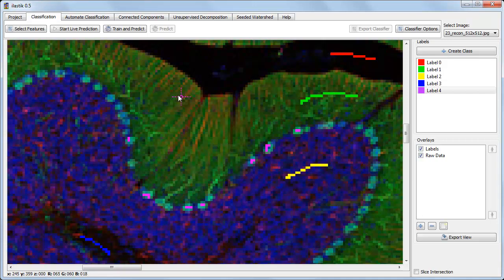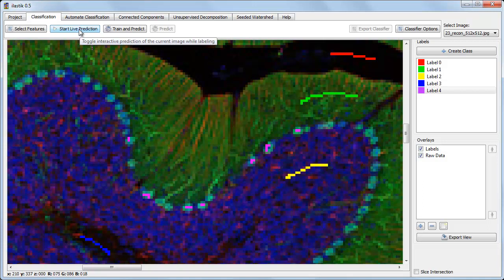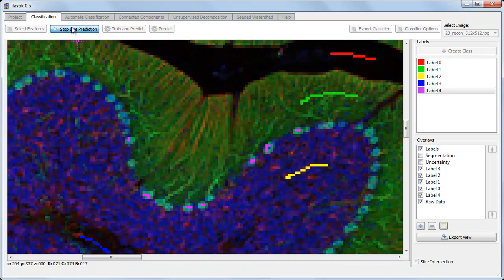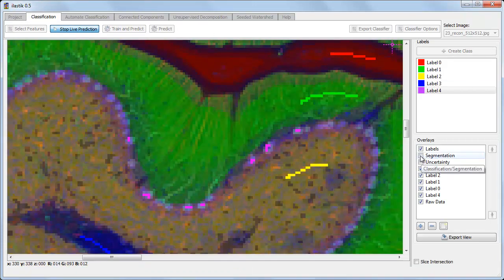I can click on Start Live Prediction, which trains the classifier, and then predicts the labels for the pixels that are visible. This will give us some quick feedback for how well we're doing so far. By turning on the segmentation overlay, I can see hard assignments for each pixel.